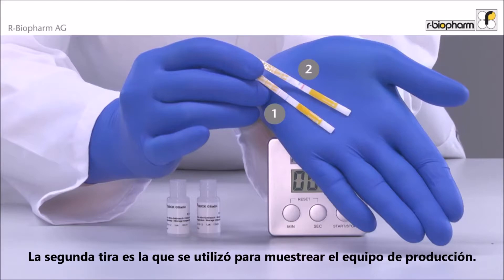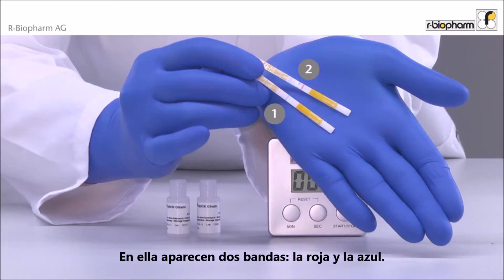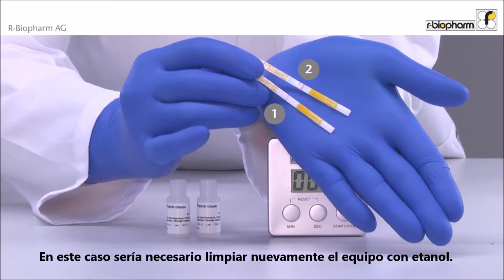The second swab sample was taken from the inside of production equipment. It shows a blue and a red band. The result is clearly positive. In this case, it is necessary to clean again with ethanol.